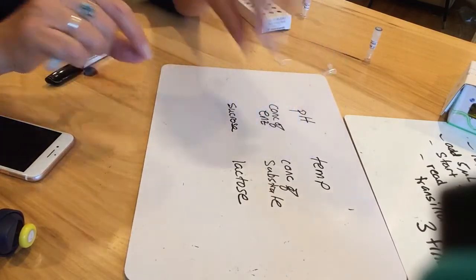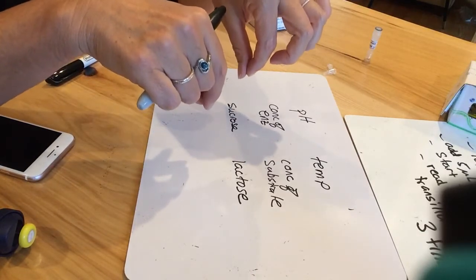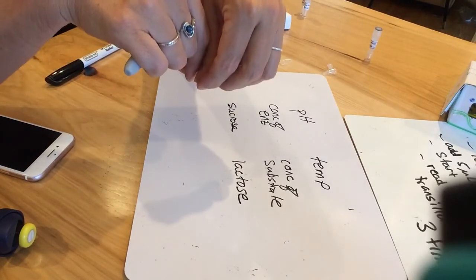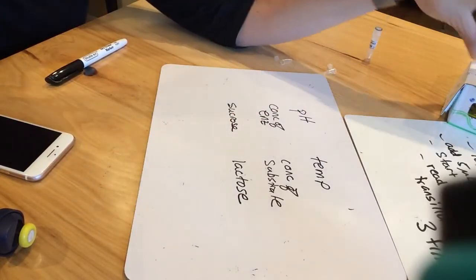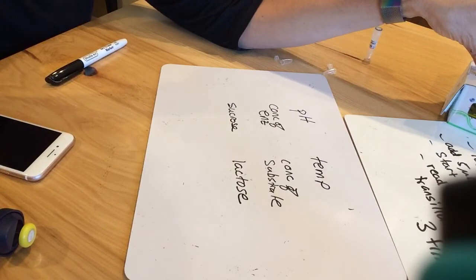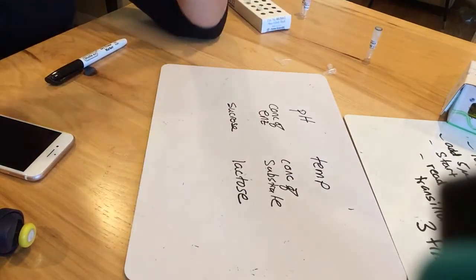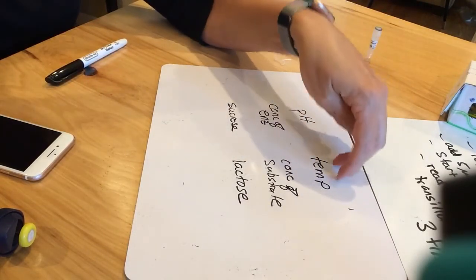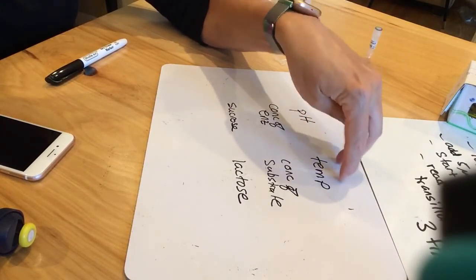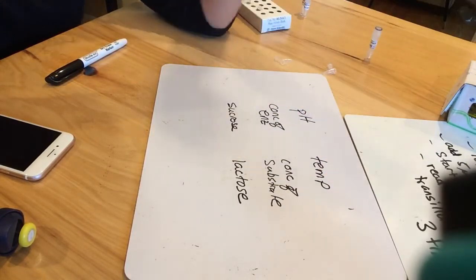So in that case, you're going to want to warm up your enzyme and substrate separately, and then add the enzyme to the substrate, and then have the reaction happening at that temperature, and then take readings really quick in the box, and then put it back, and then take it in the box, and then put it back. So for that one you're going to have to keep the enzyme and the substrate separate for a little bit to get them warm or cold to the right temperature before you do the reaction. Okay.